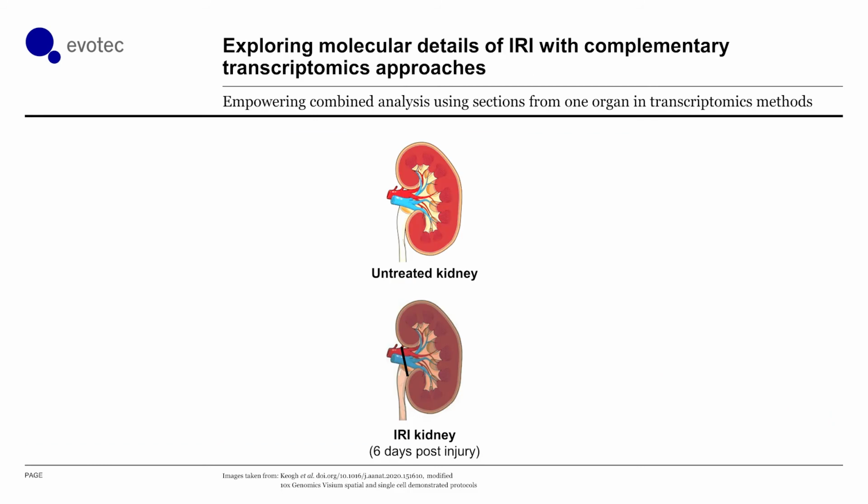To do that, they build and use a common model in renal research, ischemia-reperfusion injury, short IRI, to reproduce the CKD phenotype. IRI is an injury of the tissue that results from blood and oxygen returning to a tissue area that was cut off from both for a critical period of time before.